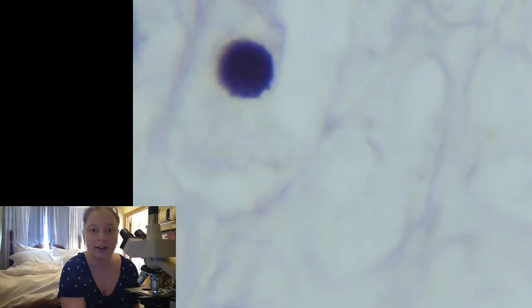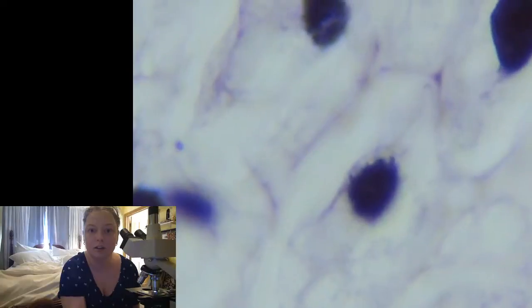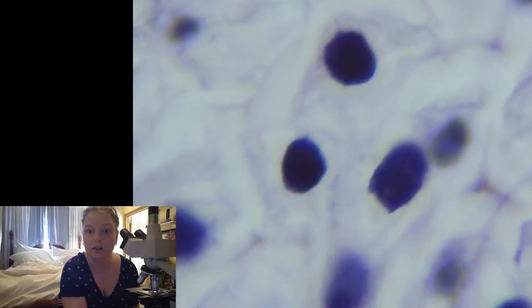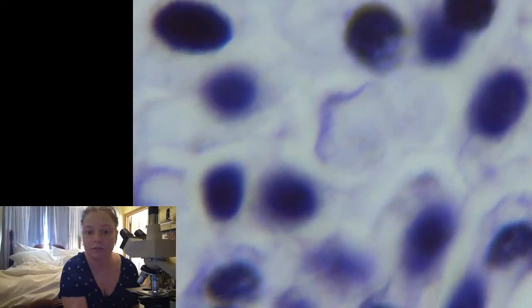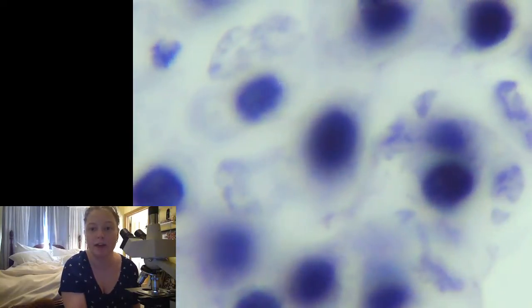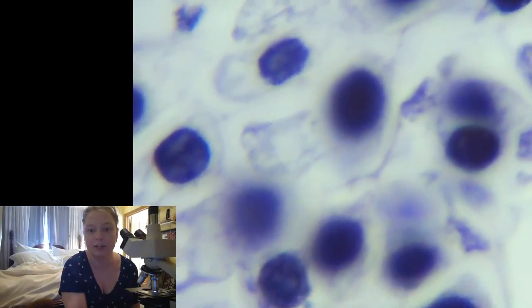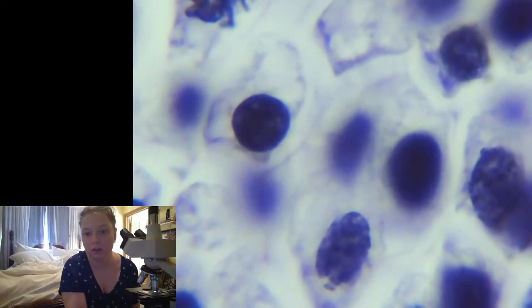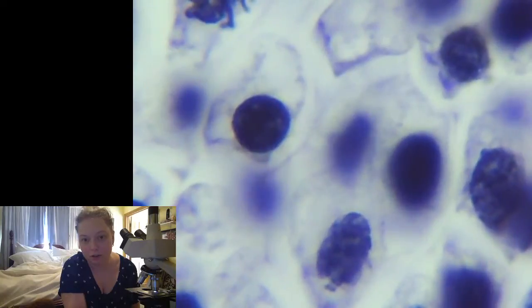Like how dark that nucleus gets. And what they're doing in there. So remember, in meiosis, we end up with 4 cells at the end. See in there, you can see all those chromosomes.